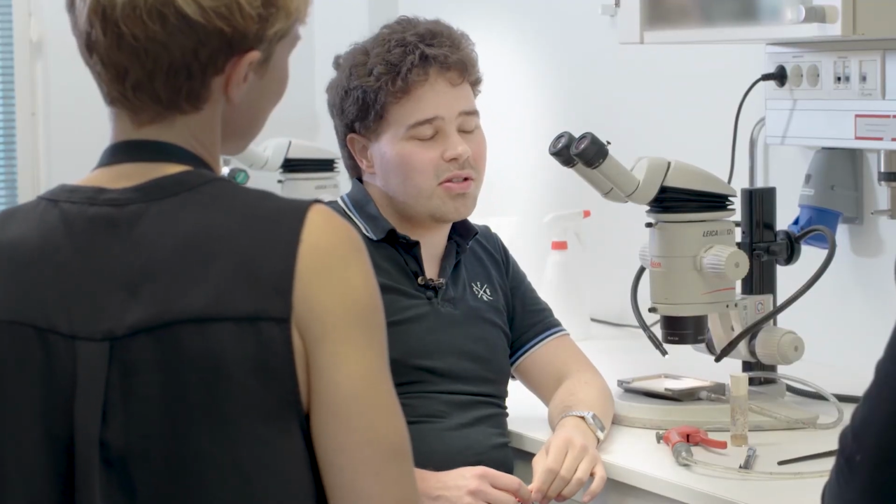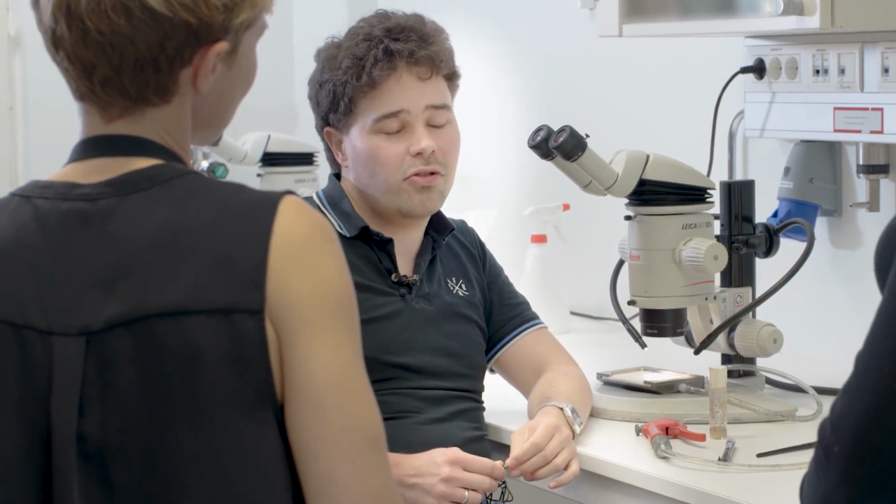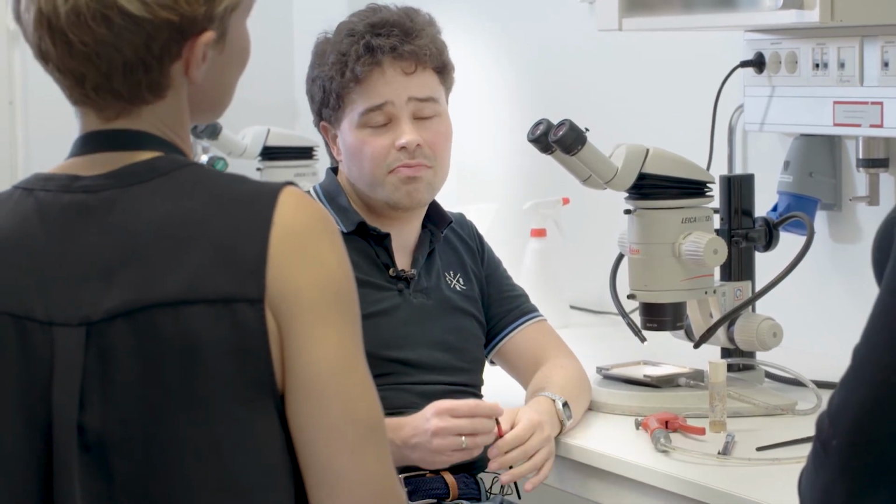Sure. This is also a great thing in Drosophila, that a lot of driver lines are available. So literally you can induce the expression or downregulate the expression of any gene in almost any tissues.